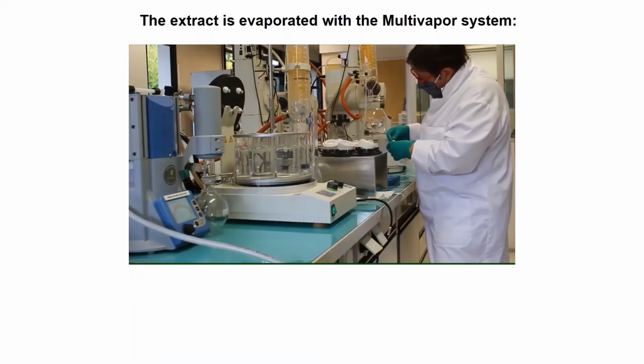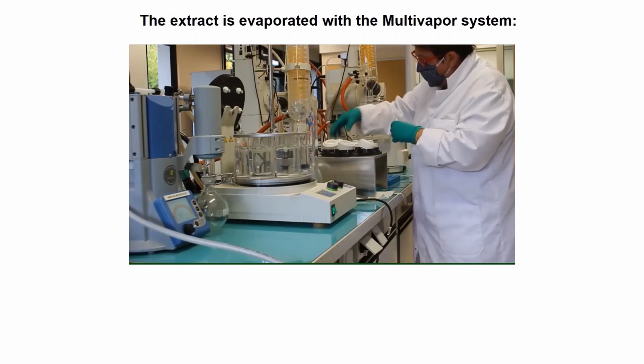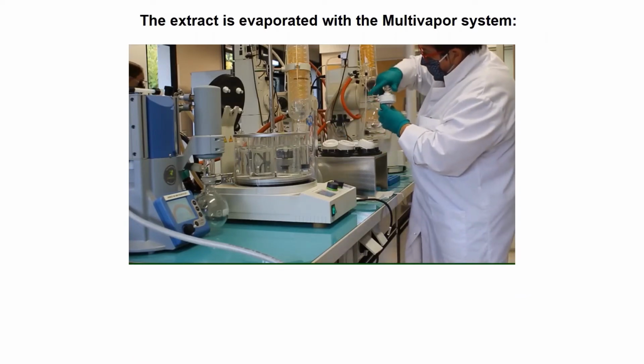The extract is evaporated to dryness with the multi-vapor system.